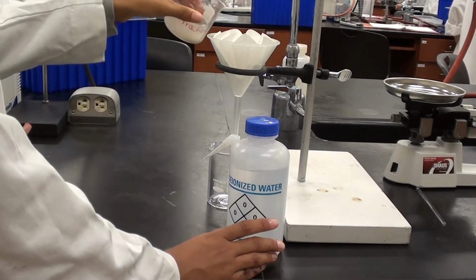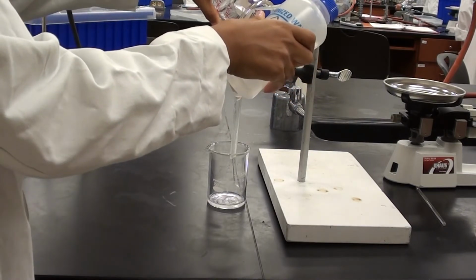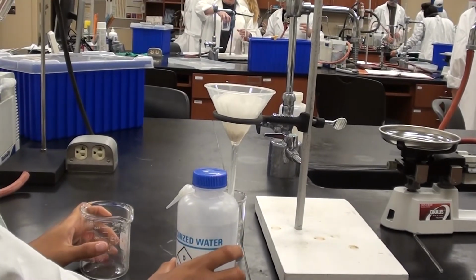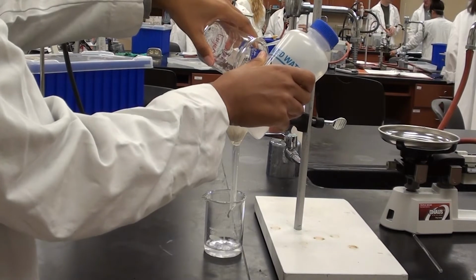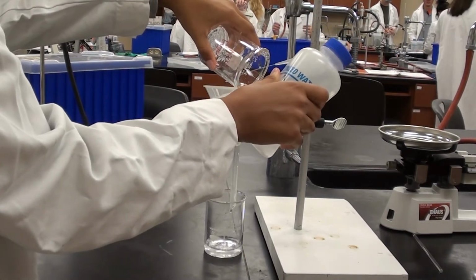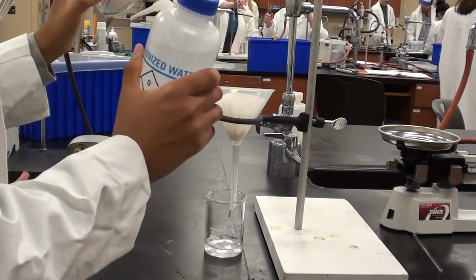So she's going to pour fairly quickly here, making sure she doesn't lose any. And you can look at her technique here. Yeah, try that again with the beaker, please. There we go. Just making sure she's getting everything out using the wash bottle. That's great. Okay.